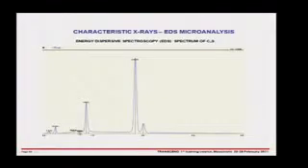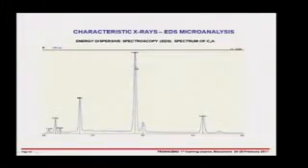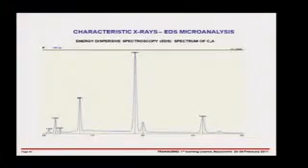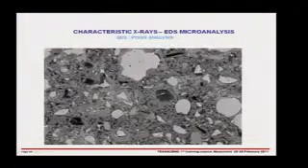The quickest detection method is to use this energy dispersive spectroscopy, and here you can go right across. You can see a peak for the silicon here and the calcium here. So this is a spectra for C3S, this is a spectra for C3A, and in this way we can get exactly what are the compositions of these different minerals.